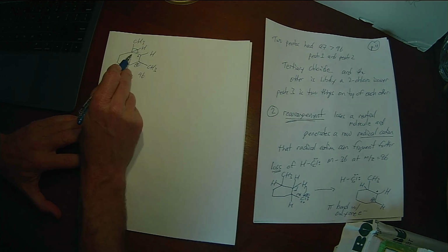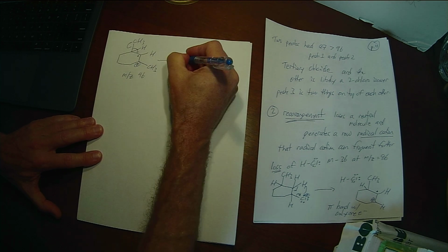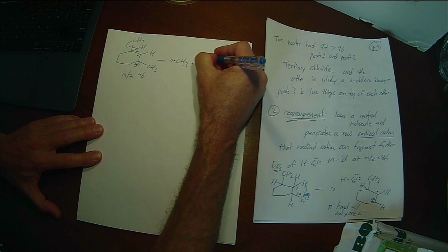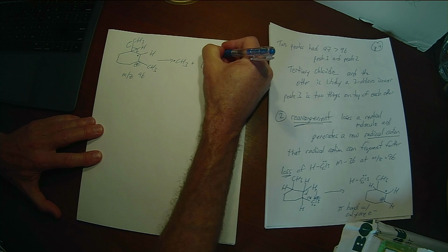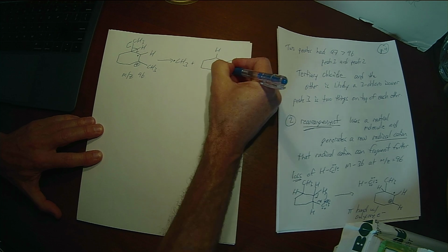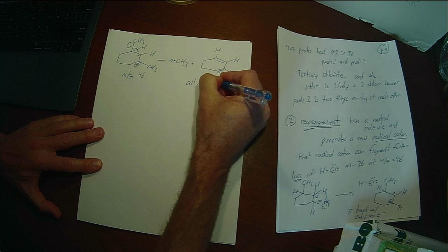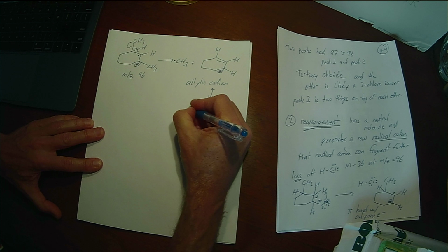One of those electrons will now form a new pi bond, and the other electron will go with the methyl group. So we'll form CH3 radical, and we will form a cation that's actually resonance stabilized. This is what we call an allylic cation. And you can write a resonance structure that puts the positive charge on the other end as well.